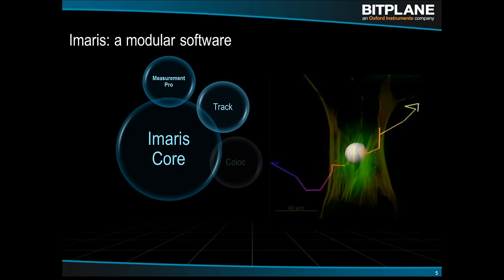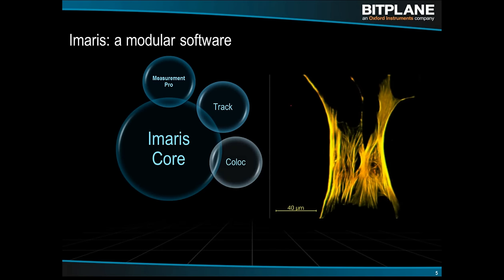time, and so on. The Coloc module is specific to looking for similarity of structure between two different color channels to give you some idea of how significant the overlap is between two signals, and then extract the positions of those overlaps, get some information about their correlation of the intensities and so on, and even build a new channel that you can then go back and detect surfaces and spots or filaments, etc. from.